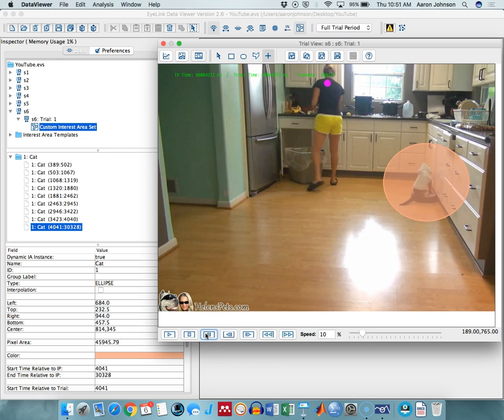Okay, so what I've now got, you see, is a time sequence whereby between the first number and the second number, that's the frame area of interest. Then it shifts to the new location. Then it shifts. Then it shifts. And so for each time, you see, they're sequential. Each time frame, we're getting this shift in the area of interest.